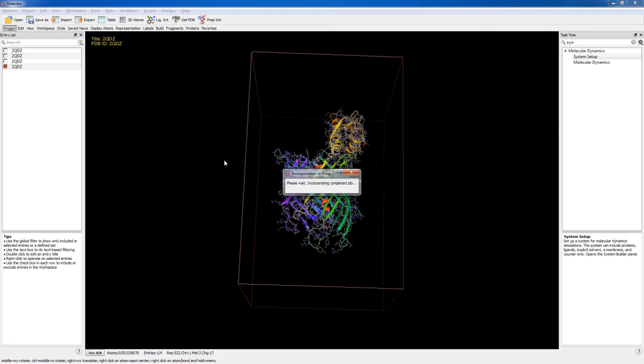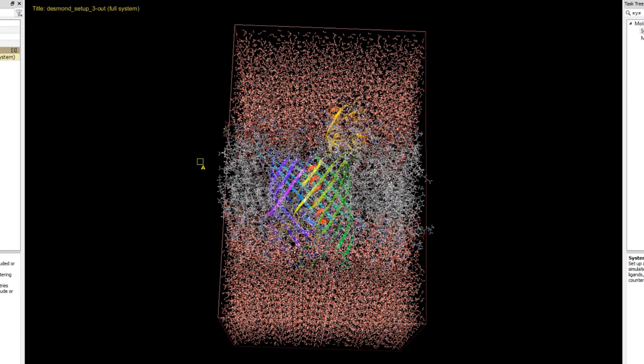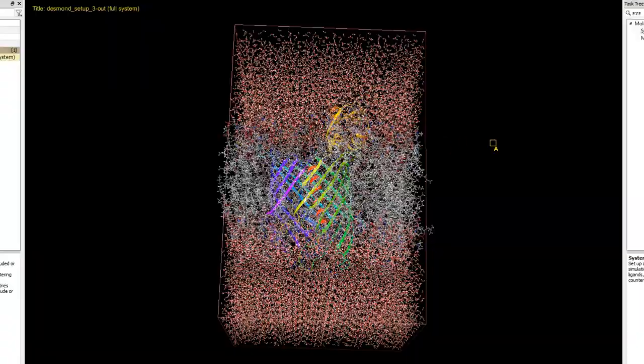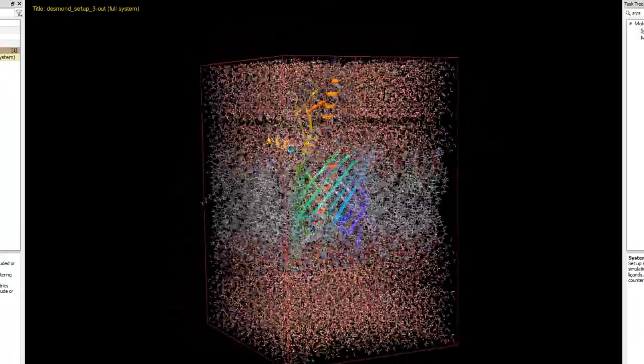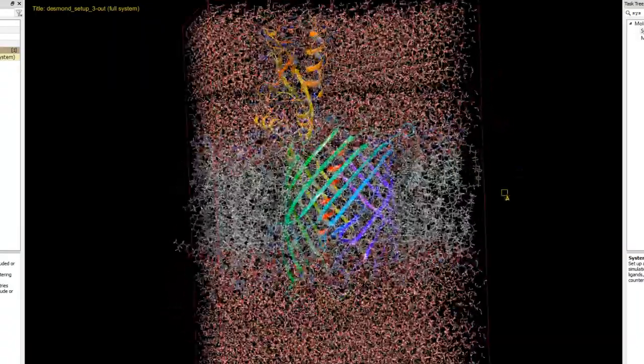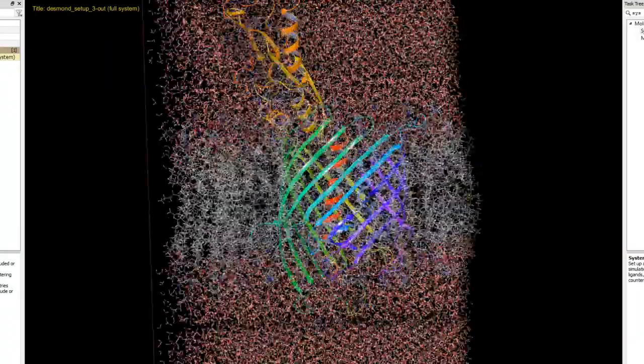Once the job finishes the system is incorporated into the workspace. Here you can see the protein, membrane, solvent, and ions. The system is now ready for simulation using Desmond.